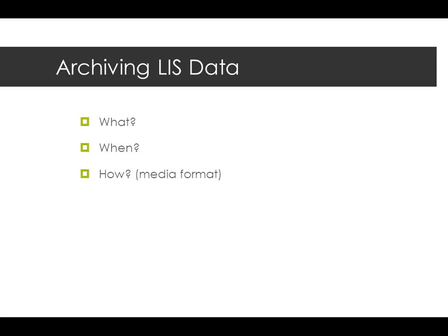Archiving LIS data, well, what are you going to archive? When are you going to archive it? And how are you going to archive it? So not all things do you really want to archive over a long period of time. All of our results eventually go to the patient medical record, and Apex will be the final repository. So, I don't have to keep things forever, and there may be things that I don't want to archive, like, well, do you really care what the sodium was 5 years ago? You might care what the CEA was 5 years ago. You might care what the PSA was. There are certain tests that are not necessarily appropriate to archiving.